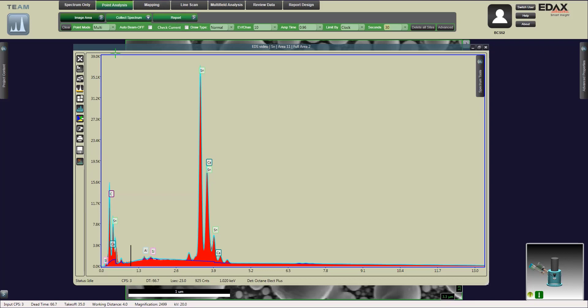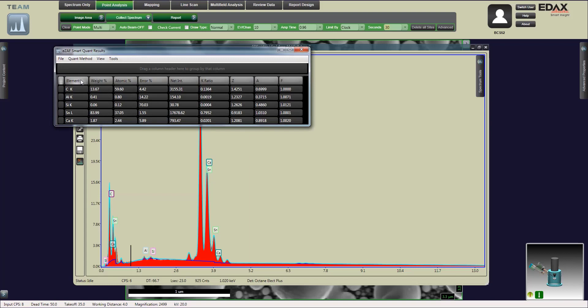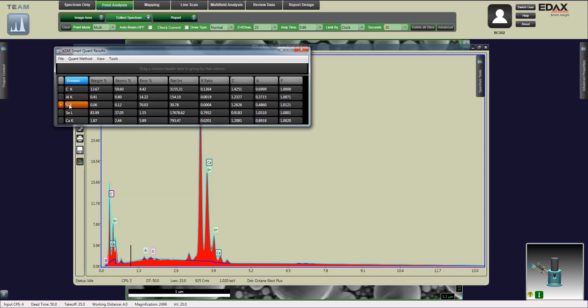To generate the report, we're just going to select the report button. We can look at our element composition and the error percentage. When I selected silicon, it's about 70% error percentage. That's a little bit too high. It might not actually be a silicon peak that we see there.